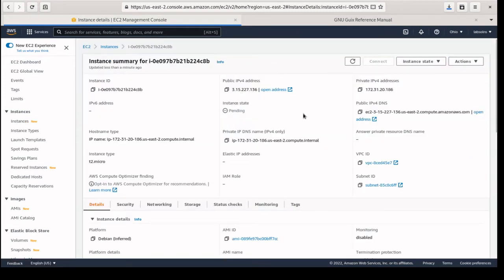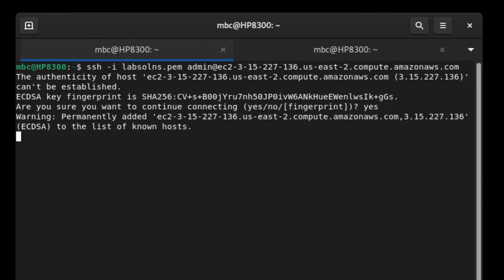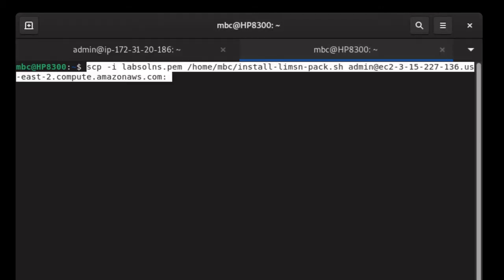So to log in at a terminal, this is the URL that I will need, and when the script initiates, it will ask me for the IP address of my instance, which is found right here. At a terminal, I can SSH into my running instance, and if we look, we can see there's nothing there.